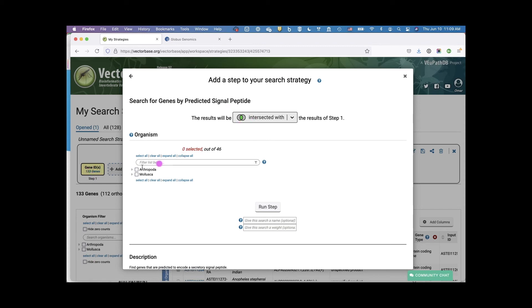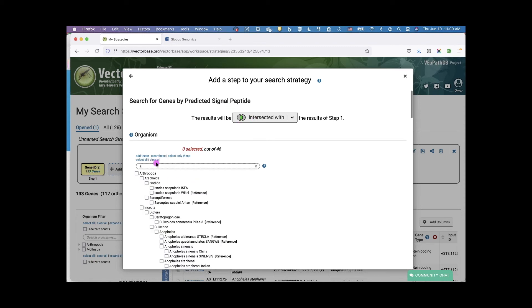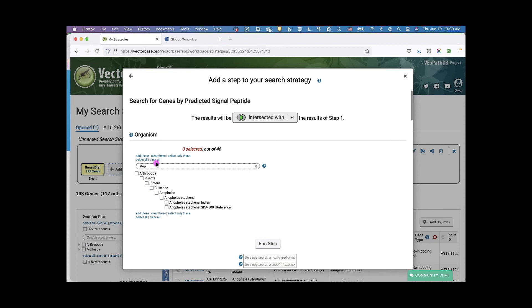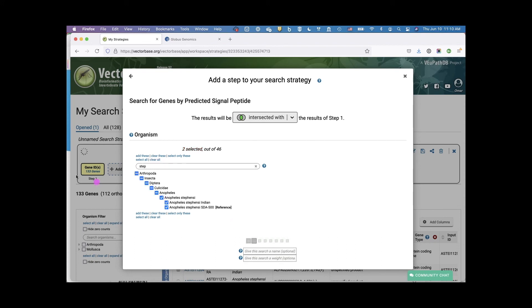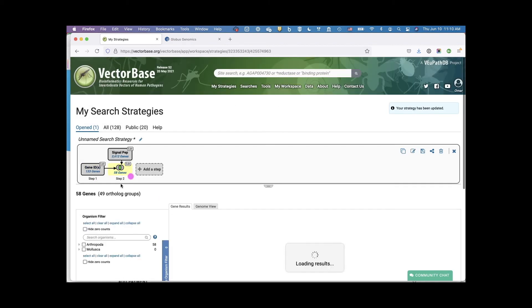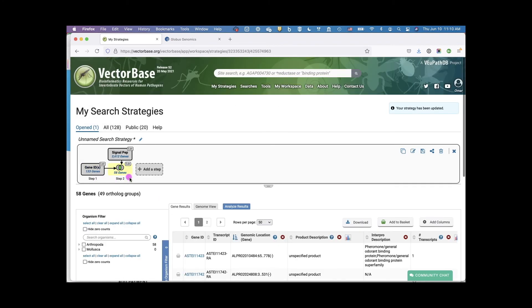I'm intersecting my results: I had 133 genes from my initial search, and now I'm going to search for genes with a signal peptide in the Anopheles stephensi genomes. It turns out there are 58 genes with a predicted secretory signal peptide. This is a nice way to start exploring your data using the different searches available in VectorBase.